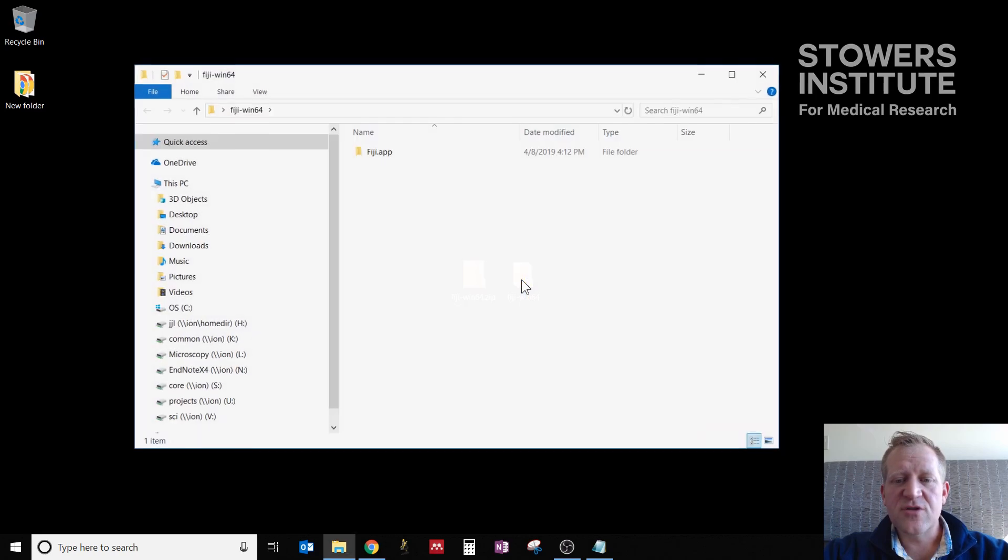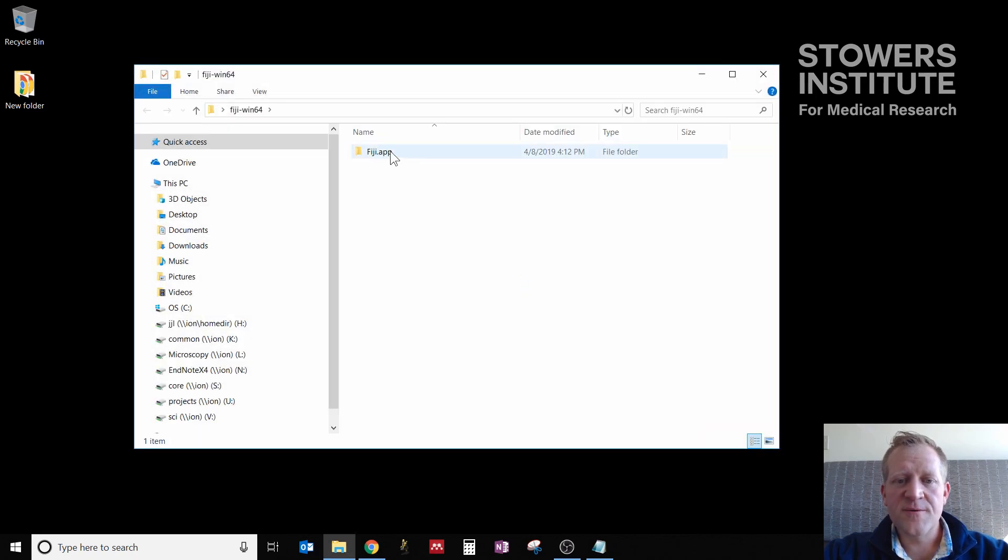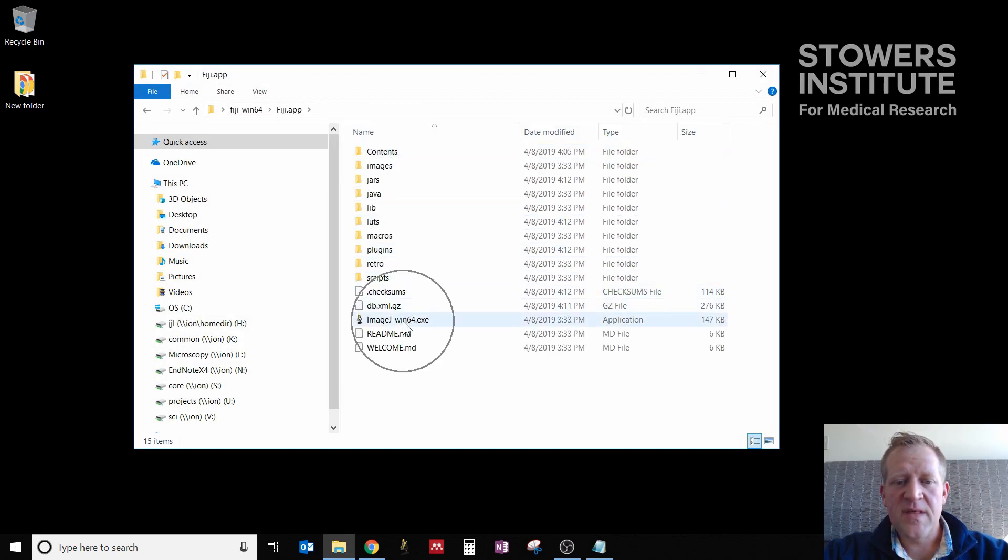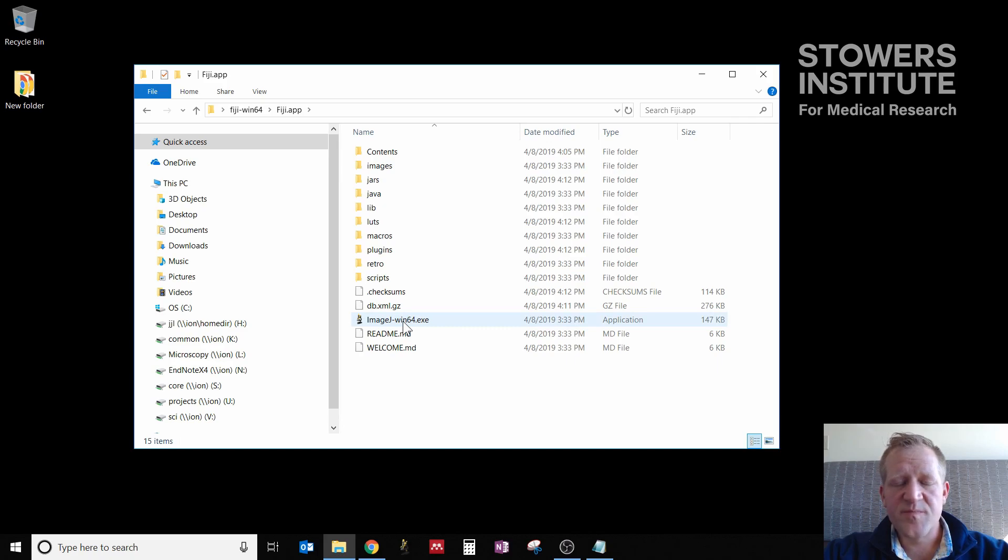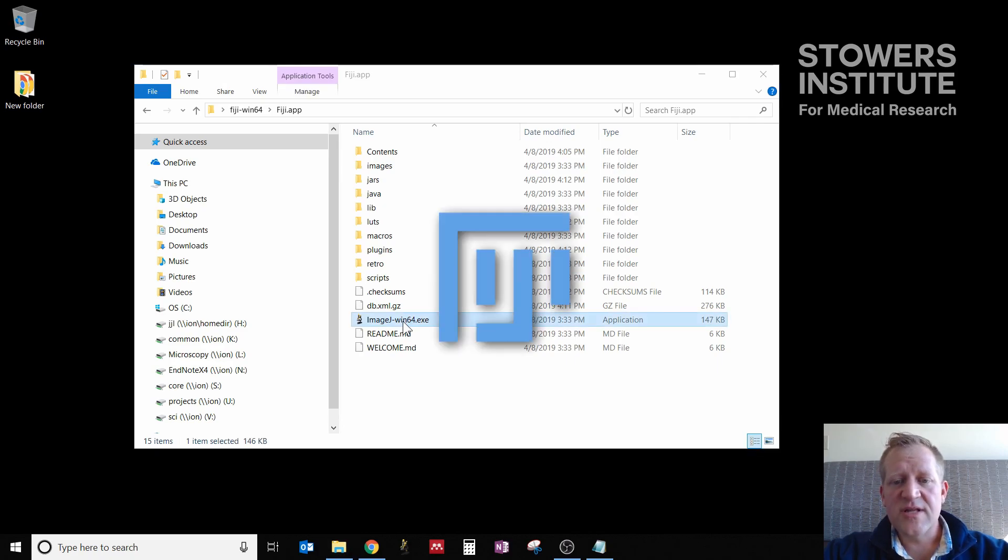So if you click into that folder and you go through the Fiji app, this ImageJ-win64 is the program that you want to run. Double-clicking that will actually launch Fiji.